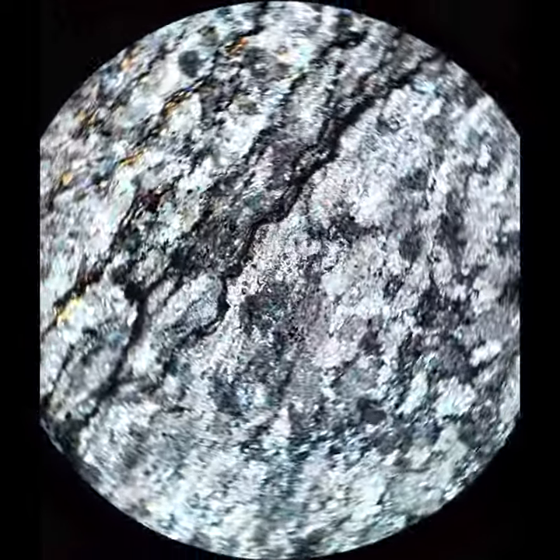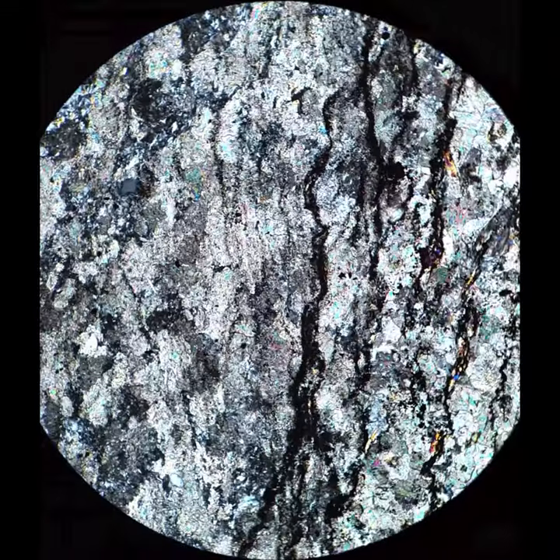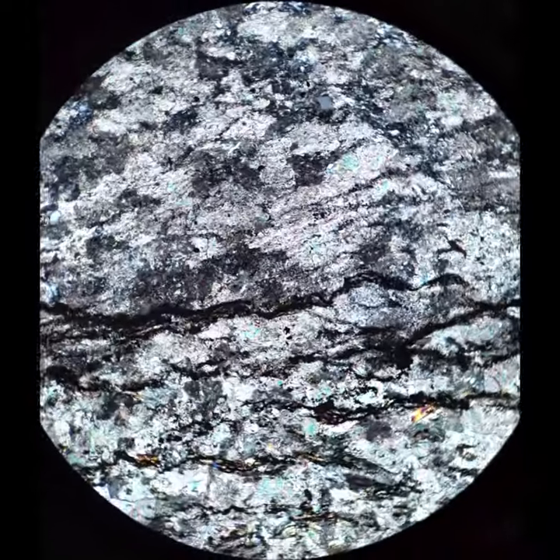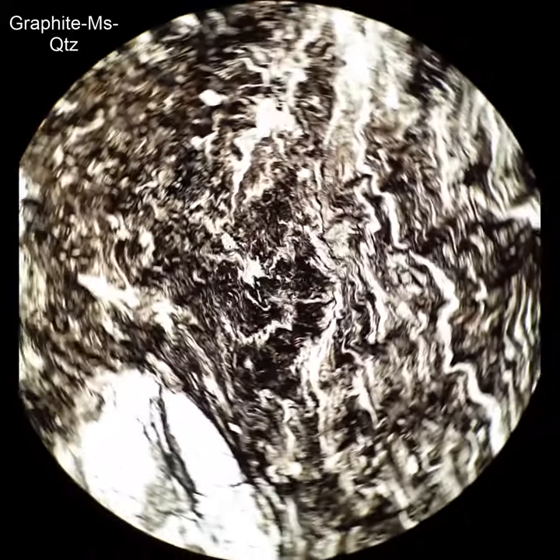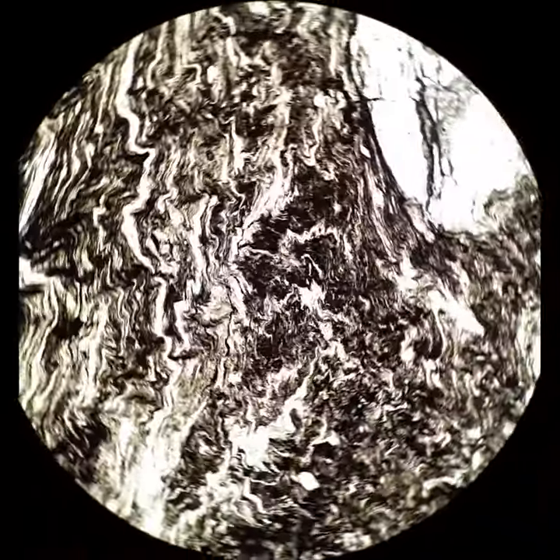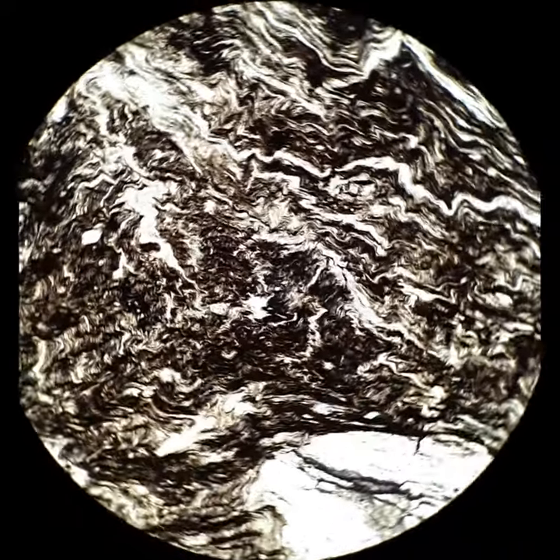Here you can see the nice interference colors of the calcite. There are more graphite-rich layers that are essentially black, with some clay-rich — now muscovite-rich — bands that intersperse with the graphite-rich layers.